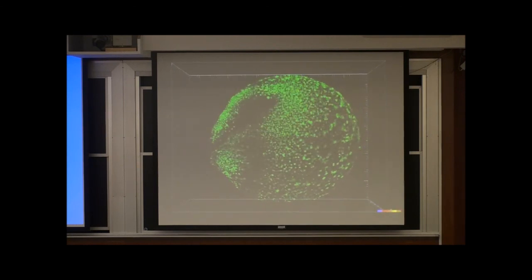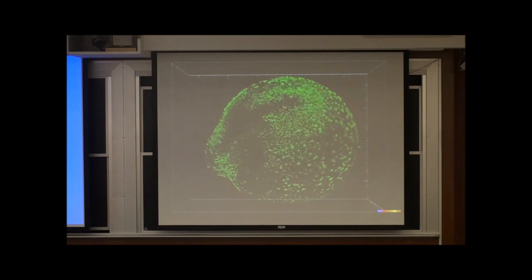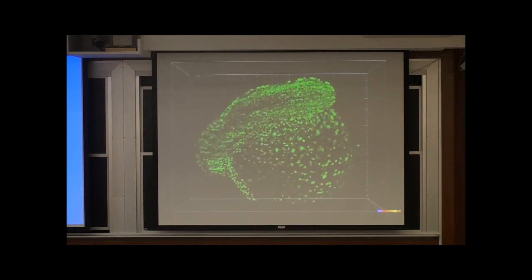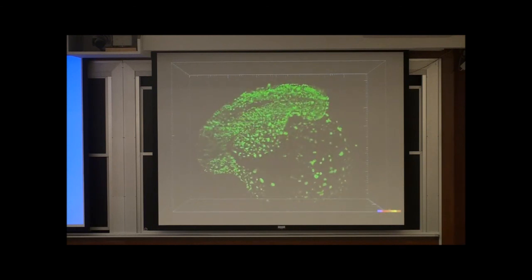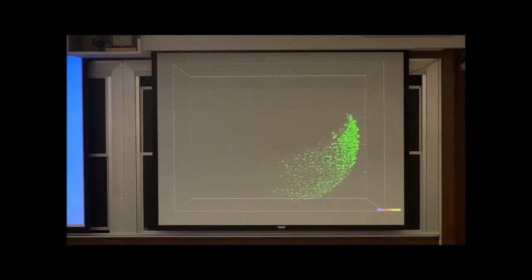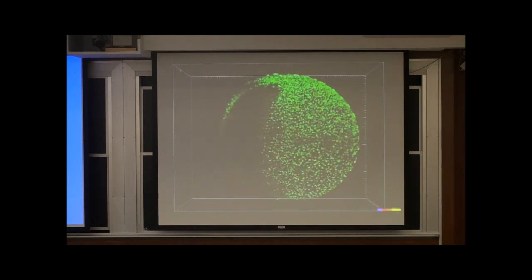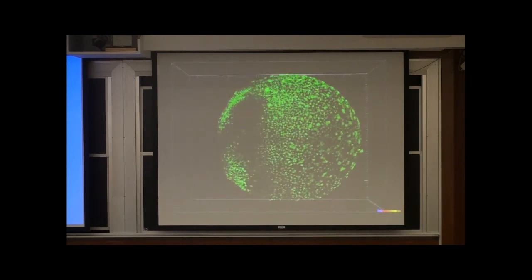But today you can buy an objective with a similar field size and high NA, but it just costs a lot more money. Actually, 10x high NA is difficult. There are 20x high NAs, but for 10x I have not seen any. But still about 1 millimeter field size.